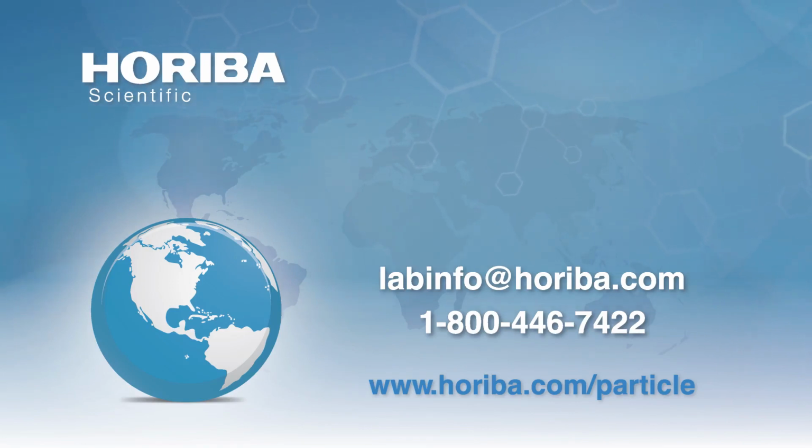So once you know your system is operating, then you'll go back and run your size distribution analysis on your unknown materials. The other comment on microplastics is the folks I've run across often are interested in these mixed samples. They're part what they'll call benign organic particles and part less benign microplastic particles, natural origin particles mixed with microplastics. And then you might need something like a Raman analyzer to determine which is which. But that's well beyond the scope of this, but you can shoot me an email and I can put you in touch with people over here working on it.